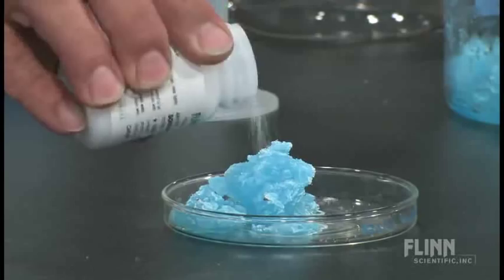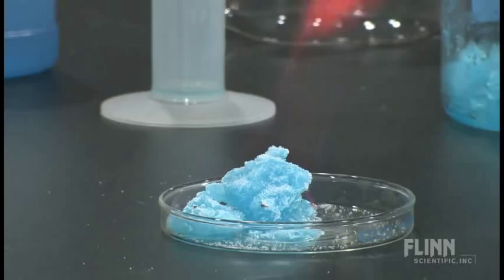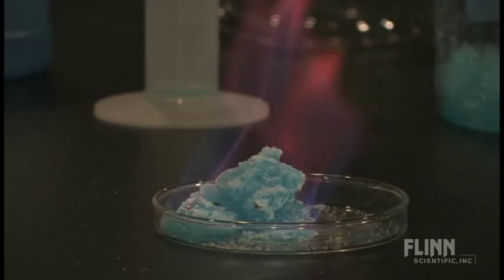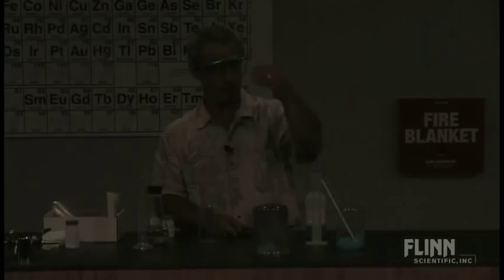And now you can even see that with the lights on, but if we turn the lights down, you get a combination there of what you saw before and sodium's flame test, that nice yellow flame there. Now, that's a wonderful little thing. Lights back on.